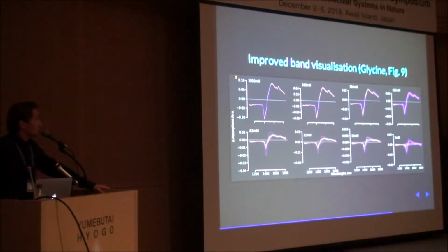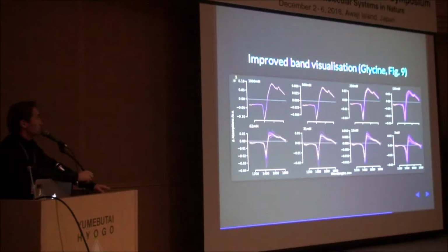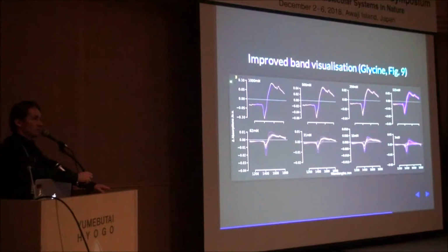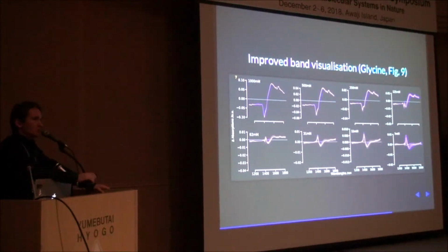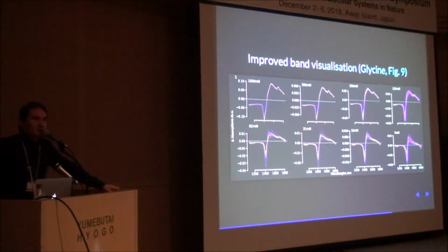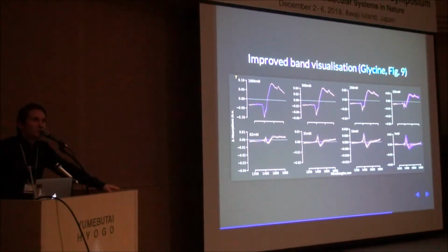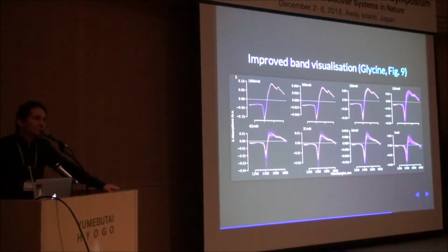Okay, so now these are spectra of glycine, so I'm just giving you another example. Here you see the number, this is the count of the consecutive. So here I'm illustrating the traditional way of subtracting spectra. What we're taught in statistics is, okay, you take a lot of spectra of water and then you just average them. In that way you will cancel the temperature influence. Then you take that average spectrum and subtract it from all the samples that you have measured.